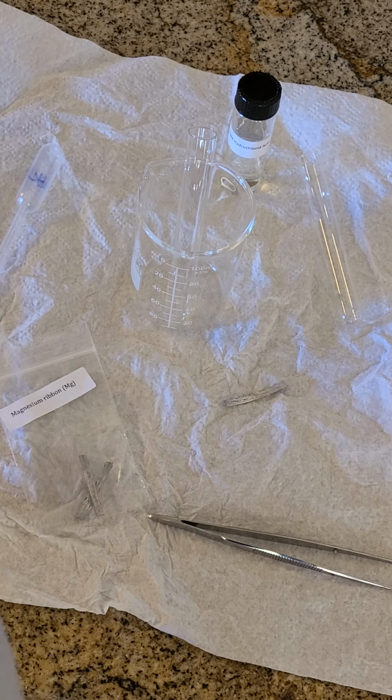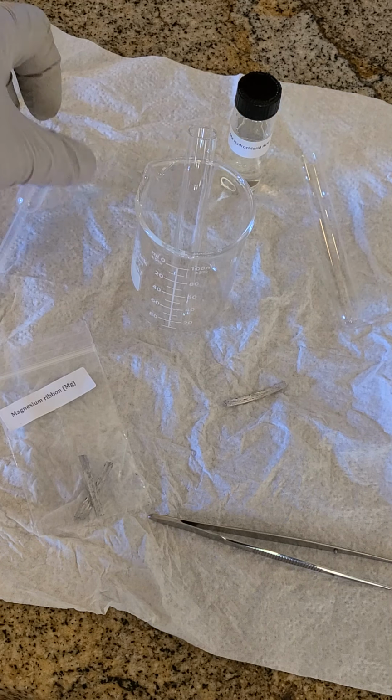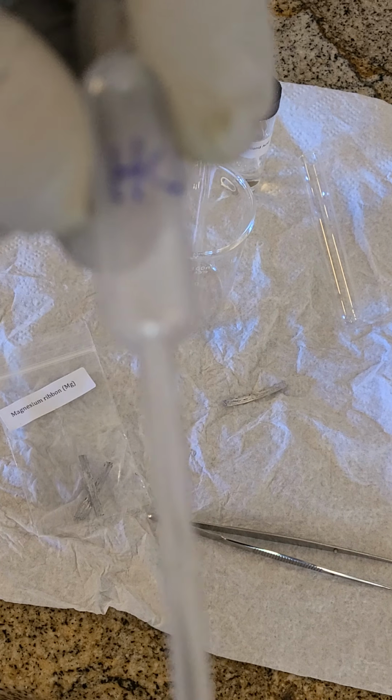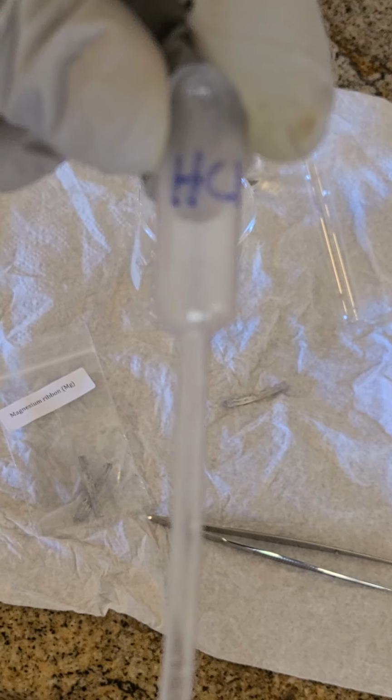This is a qualitative experiment. There doesn't have to be anything exact. We are making qualitative observations. We're not doing measurements here. The reason I bring that up is it says to add 2 mls of the HCl to your test tube. If you get a disposable pipette, and I'm weird, for all my stuff I label it, so you can see I labeled this because I'll be using HCl again. I'm going to save this disposable pipette so I don't contribute to more plastic in the environment. I know they're disposable, but I label my pipettes.